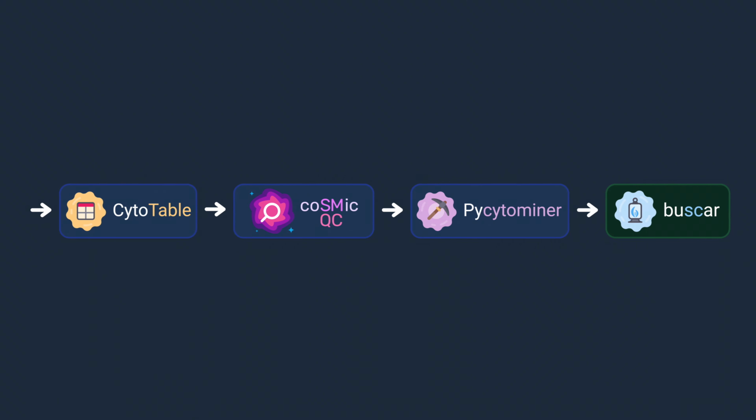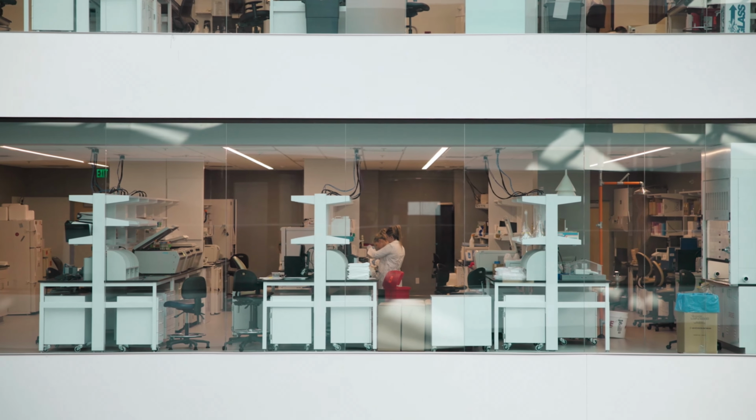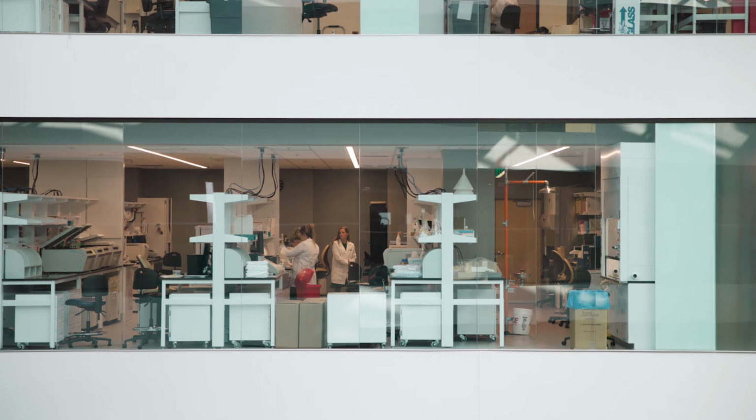Our suite of open source tools supports the field of image-based profiling. It is our hope that image-based profiling and the work of our software can help to narrow the funnel of drug discovery so that we can discover new therapeutics for diseases of unmet need.